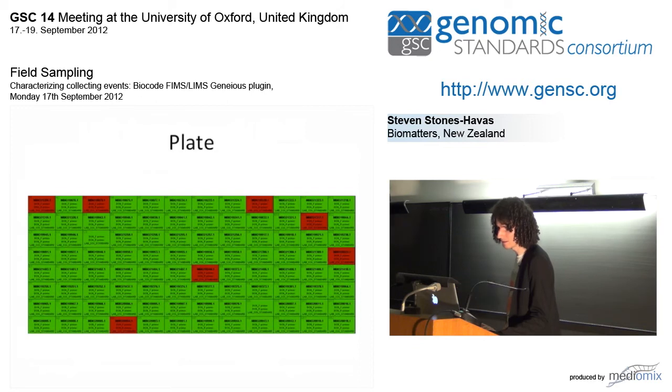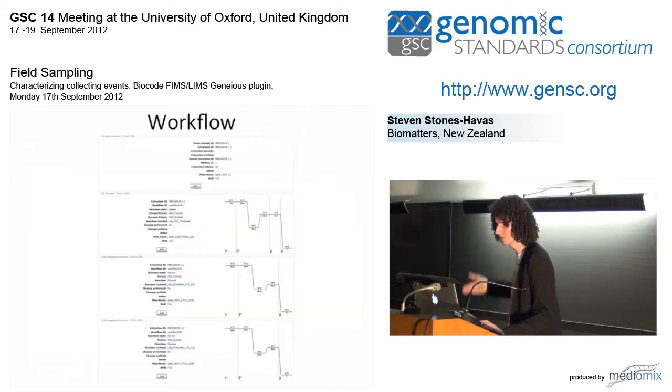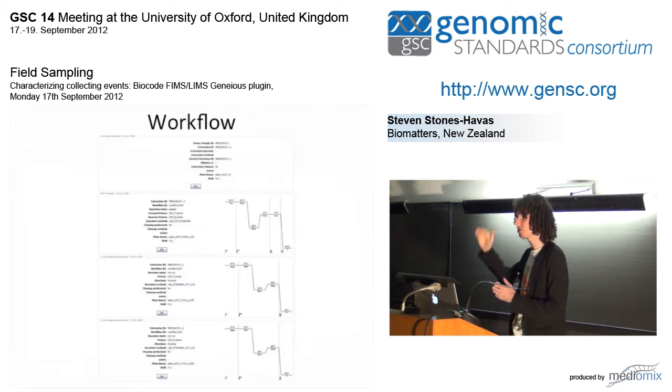information in there. And once you've entered these for extractions and PCRs and sequencing reactions, you get a workflow which looks like this. And this basically tracks the journey of one sample through your lab. So this is a really simple workflow where you've just done a PCR and then a sequencing reaction in each direction.